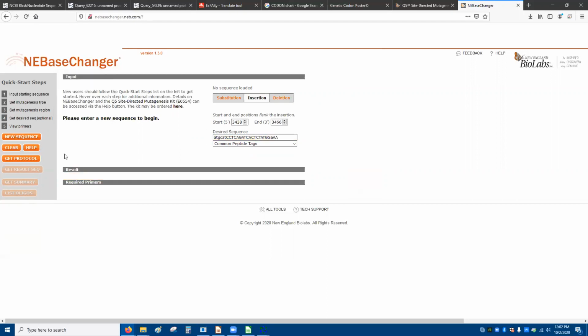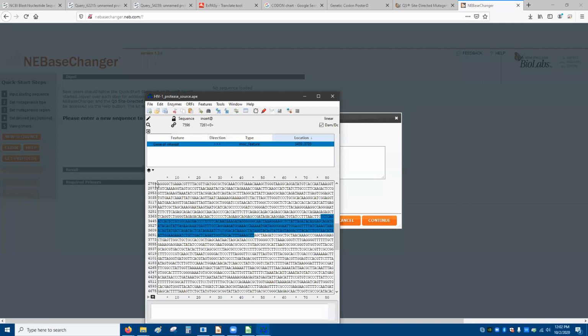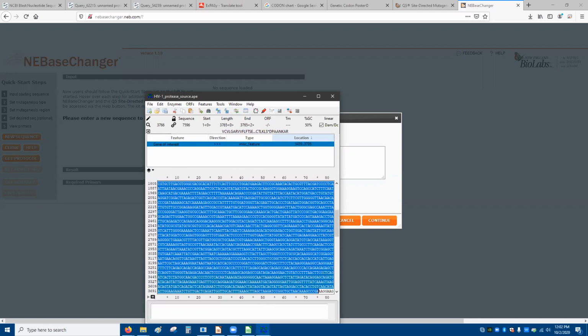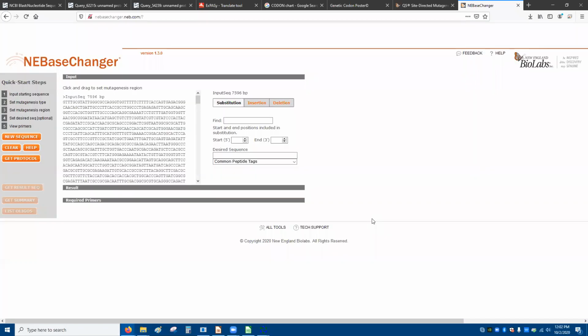So, oh, I guess I didn't save my sequence. Well, this is our starting sequence. We'll recopy that. Hopefully, it's probably going to make me put the thing back in again. Continue.